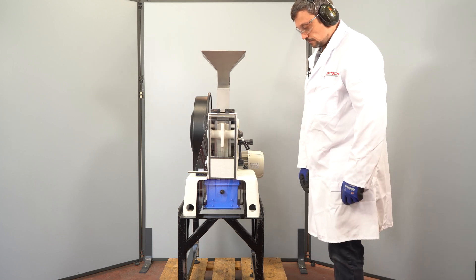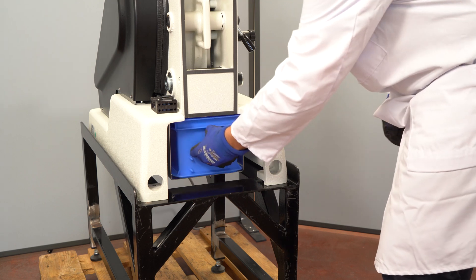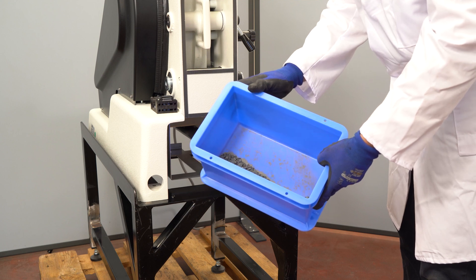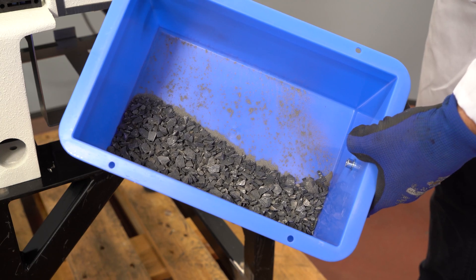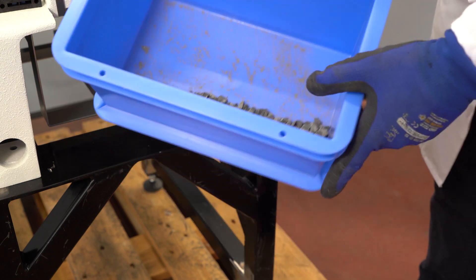Now we have our final result. The sample may contain some very fine particles such as dust, while other fractions will be irregular particles that passed through the gap dimension.